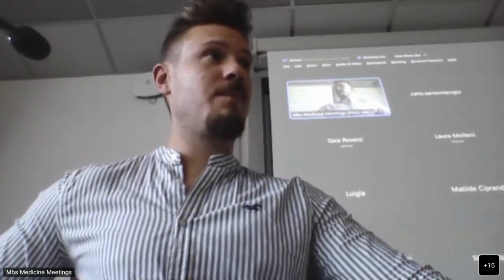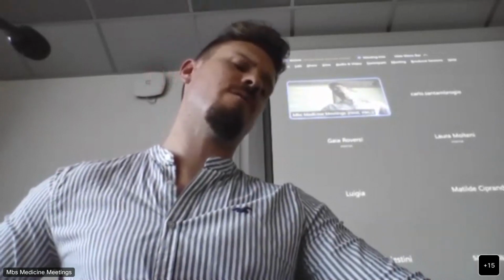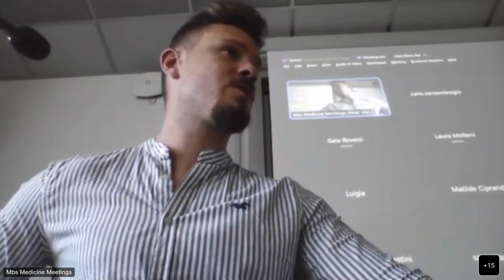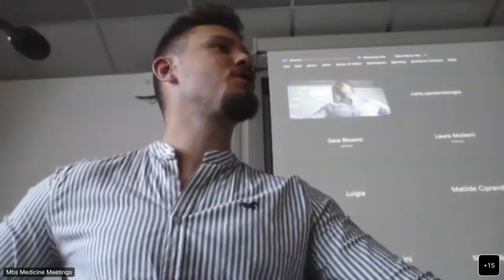My answer is yes. We actually recently performed some work in collaboration with the University of Surrey, where they were interested in the proteomic distribution of certain fragments of collagen-related proteins in cartilage. So this is something that we've been able to do. As you can imagine, it's not the simplest tissue to work with, and it did require a certain degree of method optimization.